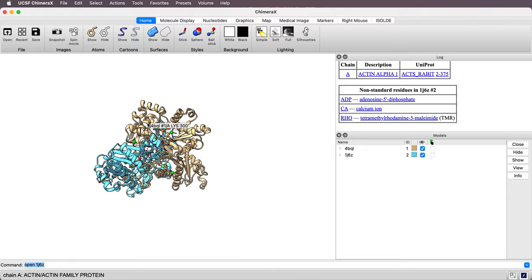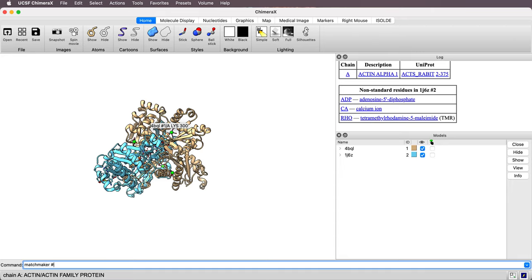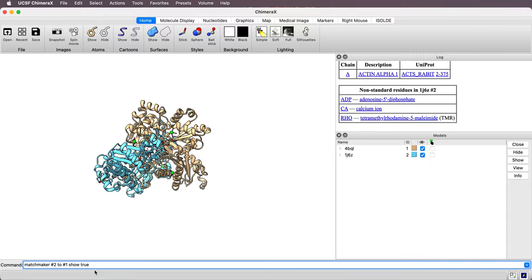So I'm going to first want to align them. I'll use the matchmaker command to do that. Say matchmaker number two, that's the rabbit actin to number one. And then I'm going to add options, say show true. That means show the sequence alignment between the two.